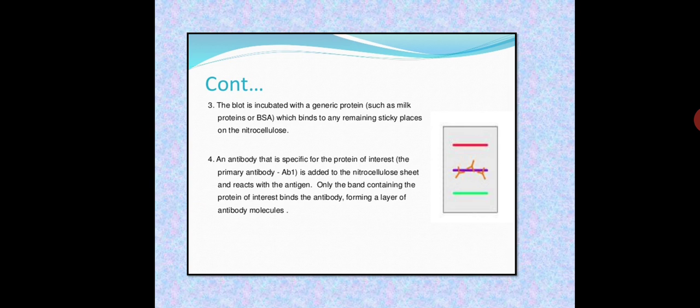Now the next step हमने southern और northern blotting में देखा कि probing and hybridization, okay. In the previous technique we saw that there was addition of the probe और वो probe complementary sequence मतलब अपने जीन ऑफ इंटरेस्ट के साथ बाइंड होते थे, तो उस प्रोसेस को हम हाइब्रिडाइजेशन बोलते थे. But in this process hybridization is not possible. Hybridization is not possible. Why?